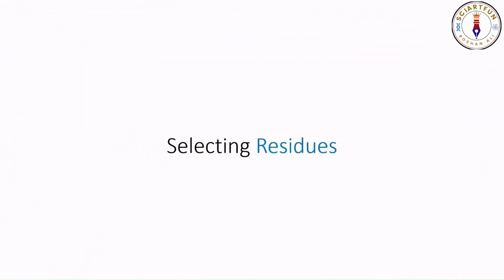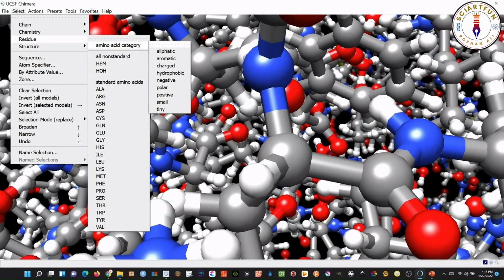You can also select a specific residue in the target structure. Here is the list of all the residues that you can select in this molecule. You can select amino acids according to their properties. For example, you can select all acidic amino acids, or you can select all the tiny amino acids. You can select charged amino acids or aromatic amino acids, etc. You can select non-standard groups. You can select water molecules. You can select all the heme groups. You can select all tryptophan residues, all alanine residues. You can select valine molecules.